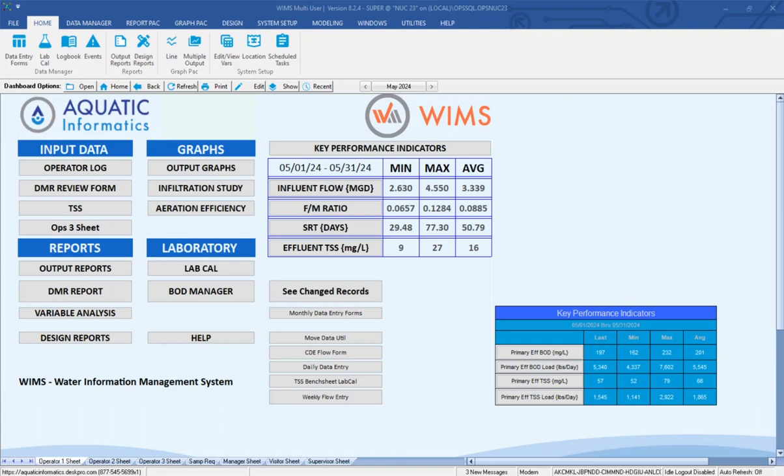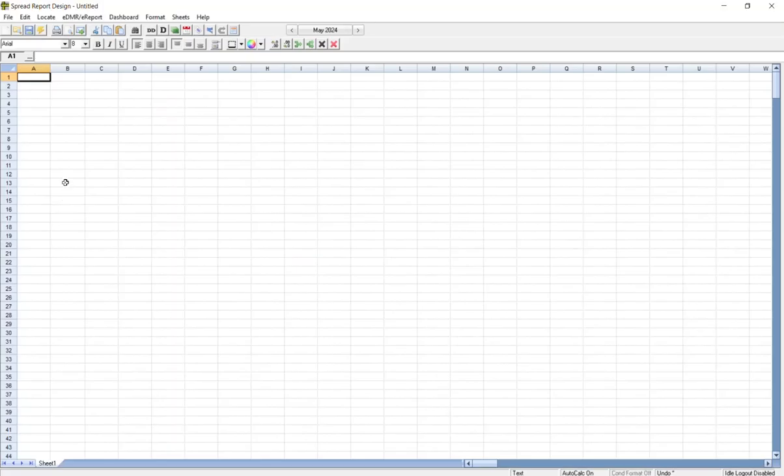In this video, I'll be taking you through how to design a process report showing the influent and effluent BOD and TSS, to get a long-term trend analysis of it. So what I'm going to do is go to Design, Spread Reports. I've got my report builder pulled up here, and I put my cursor where I want my data to start.